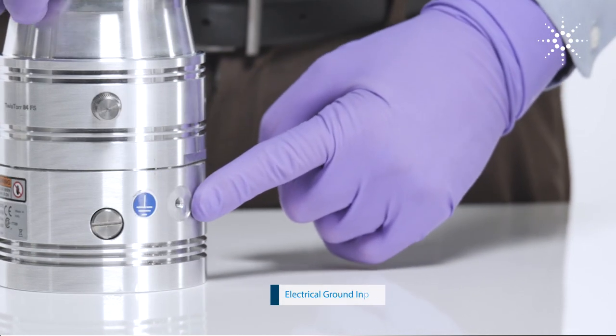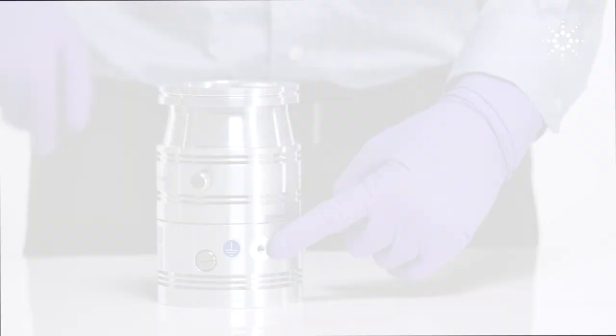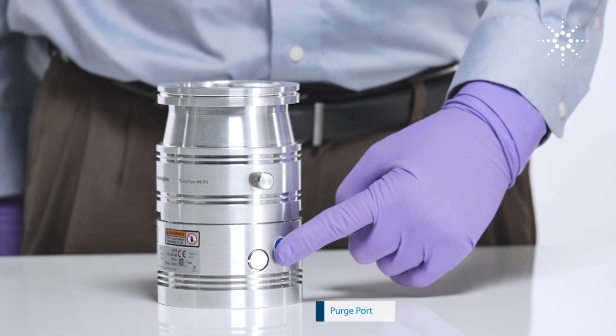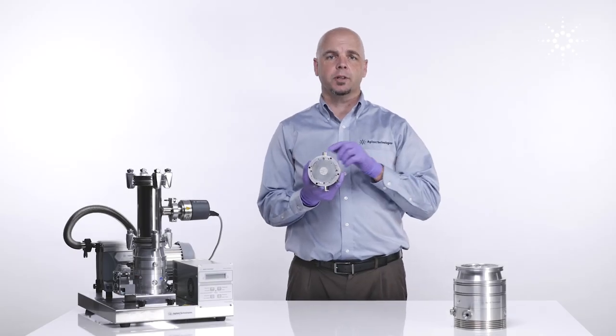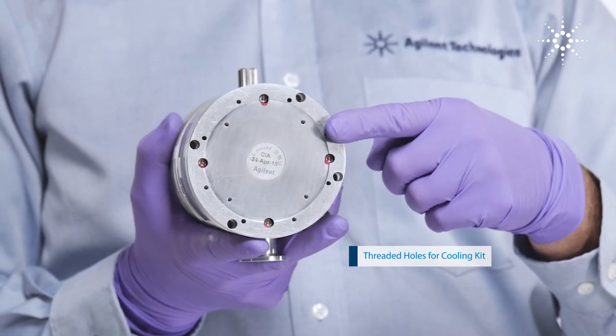If an additional electrical ground is required, it can be connected here. The purge port located here can be used to introduce inert gas to protect the pump bearings in aggressive applications. And finally, on the bottom of the turbo pump, you will notice several threaded holes used to mount one of Agilent's cooling kits.